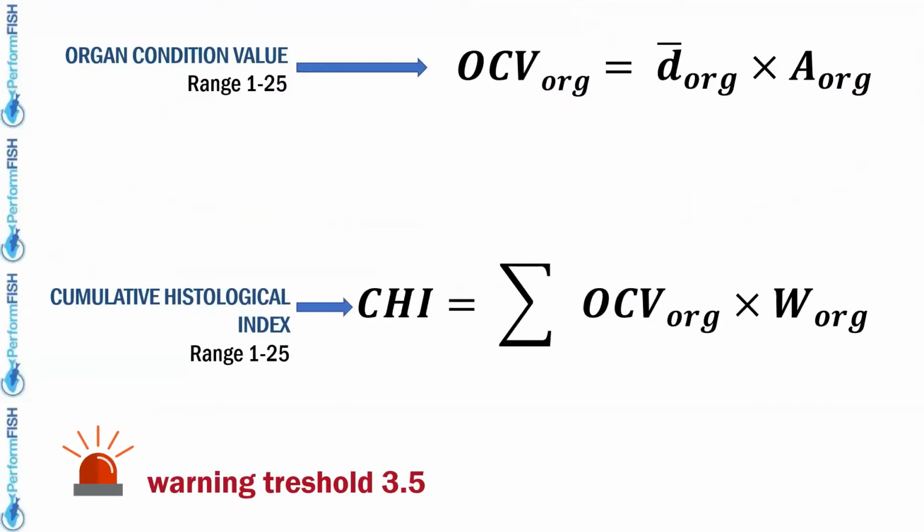However, later we discussed with a colleague, most of all a friend. He is an expert in systems theory and systems biology, who confirmed the correctness of our choice and helped us to finalize our formula. So we decided to summarize the large amount of data provided by the scoring system into a single value that would provide general information about the histological quality of the larval batch.